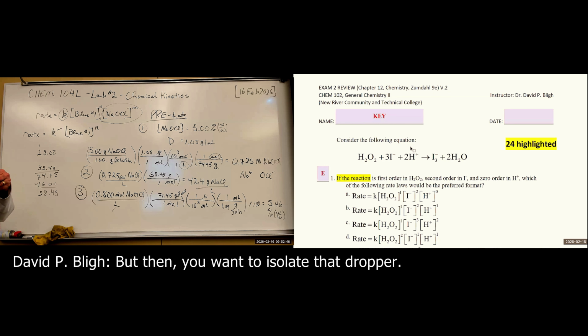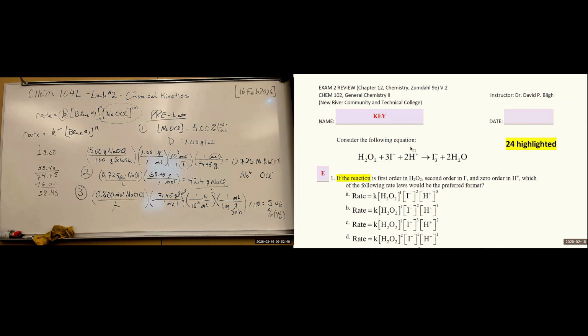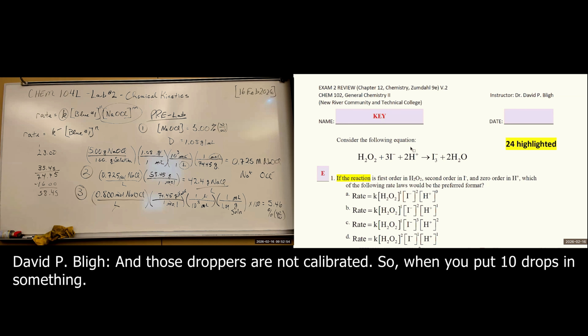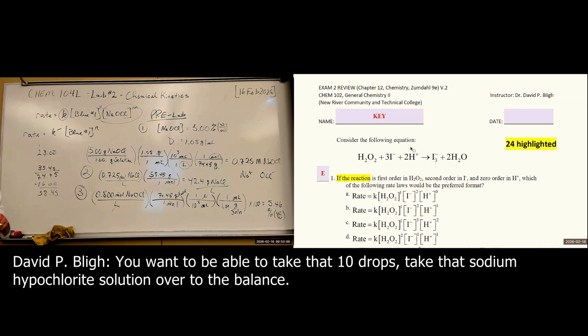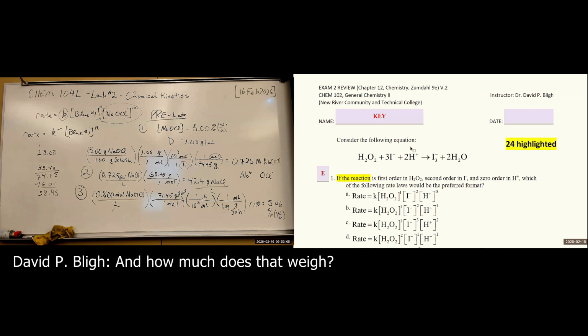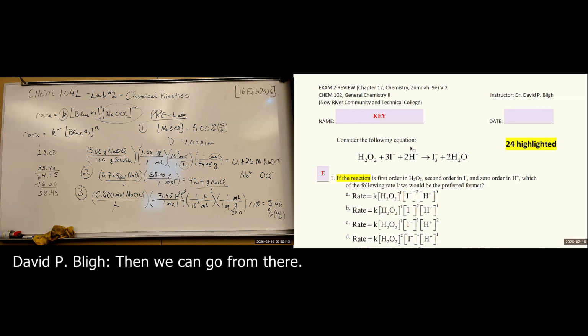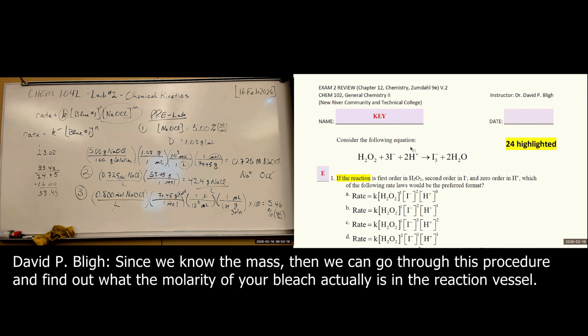But then you want to isolate that dropper, because that dropper is the one you're going to use through the entire experiment. And those droppers are not calibrated. So when you put 10 drops in something, you want to be able to take that 10 drops, take that sodium hypochlorite solution over to the balance, and see how much does that weigh? Or you could do 50 drops and say, how much per drop? Then we can go from there. Since we know the mass, then we can go through this procedure and find out what the molarity of your bleach actually is in the reaction.